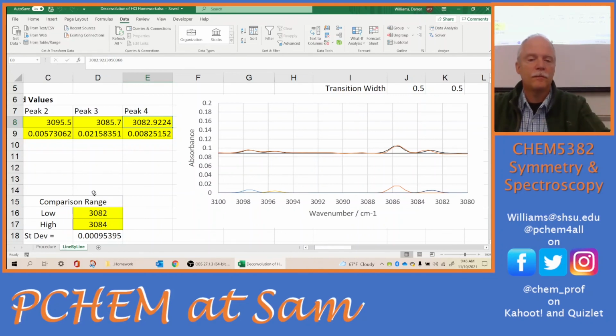Now, would doing some data analysis and smoothing the data be a good thing to do? We said we have a lot of noise, and there are mathematical ways to do that. Like if you're doing this for a paper and say, well, I'm going to smooth the data out with this function. Yes. In smoothing, and that's a whole other topic, the best method for smoothing data is called Fourier transform smoothing, or Fourier smoothing.